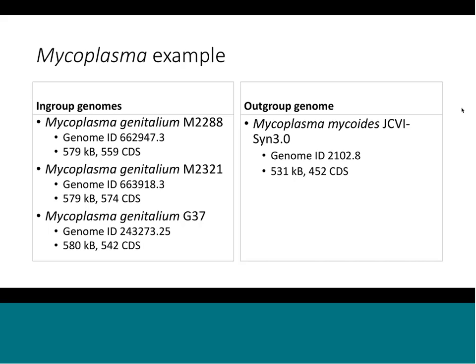And so there are all these H37Rv genomes. So the name's not specific, but that number is specific to that particular genome. So I just wanted to bring that up so everybody's aware that sometimes you can use the Genome ID number to find a specific genome when there are multiple genomes that have the same name.